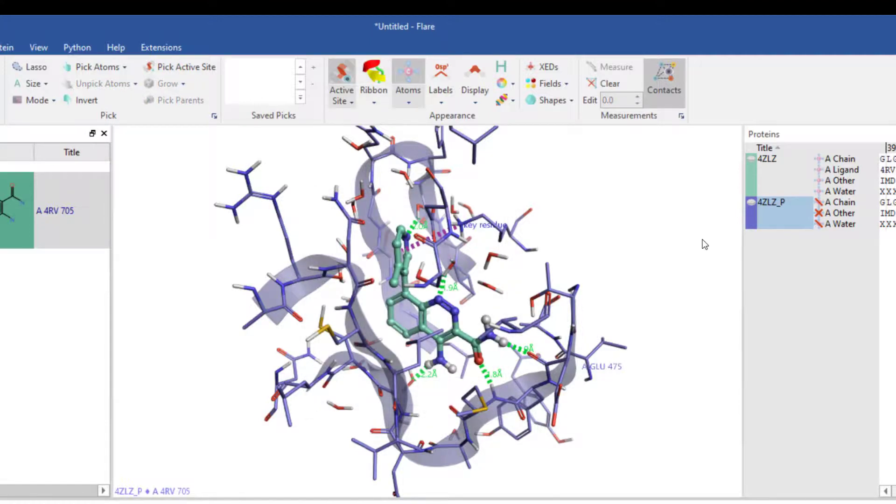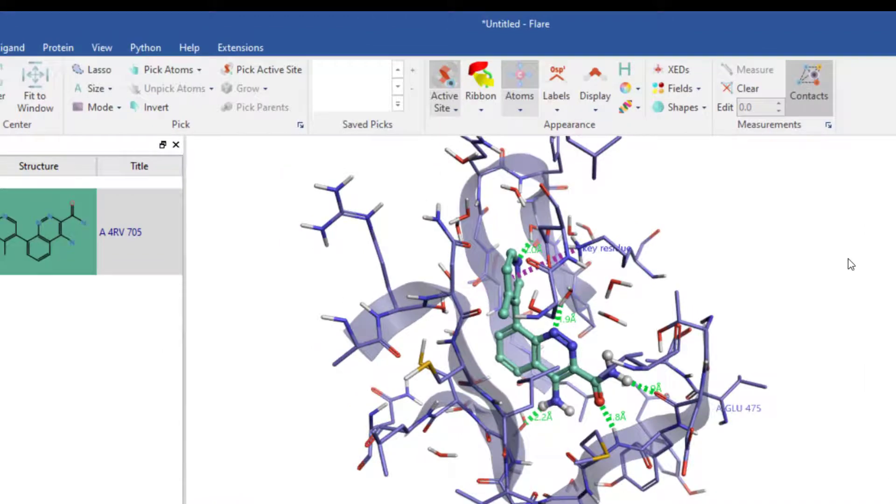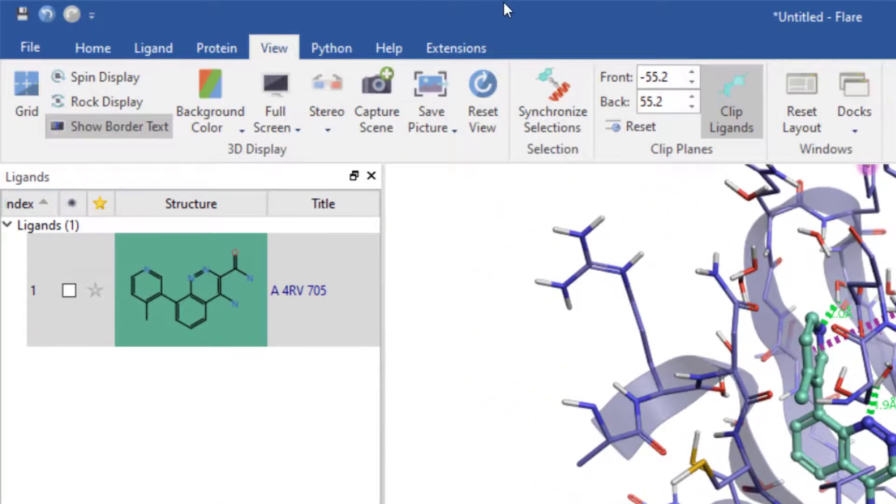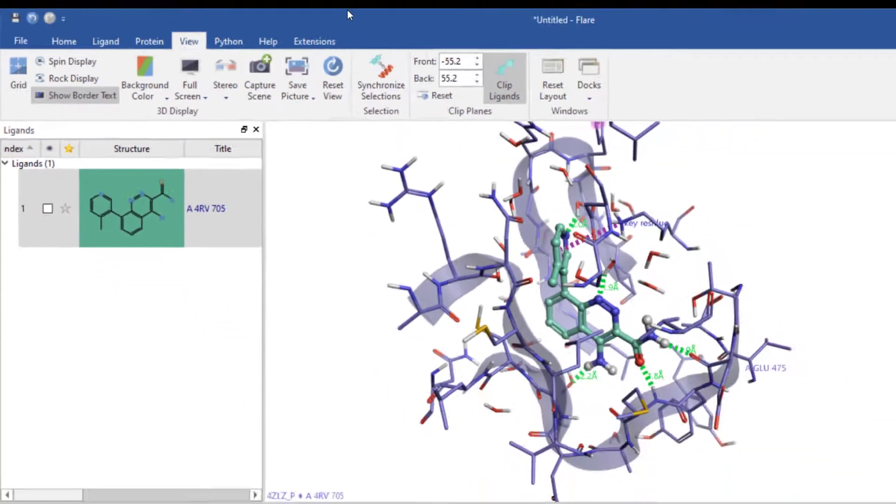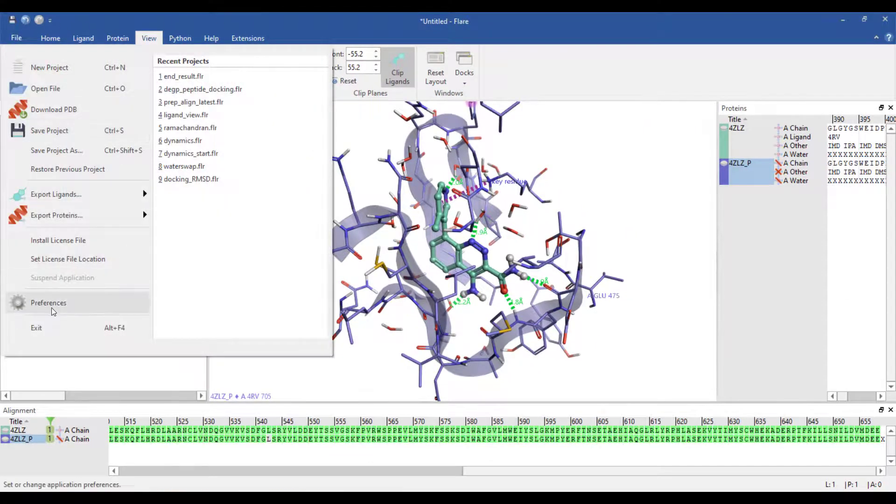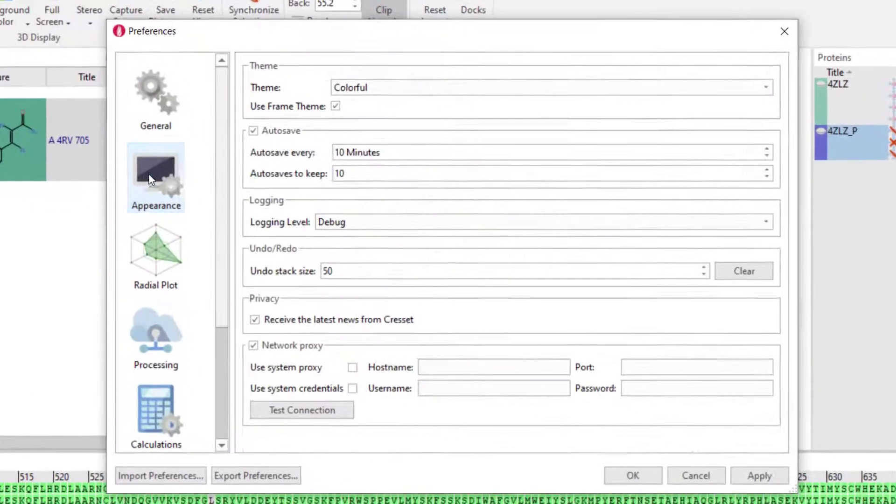Once you have your 3D display as you want it, an image can be saved to file by going to the view menu and hitting the save picture button. Image properties can be optimised via the appearance preferences.